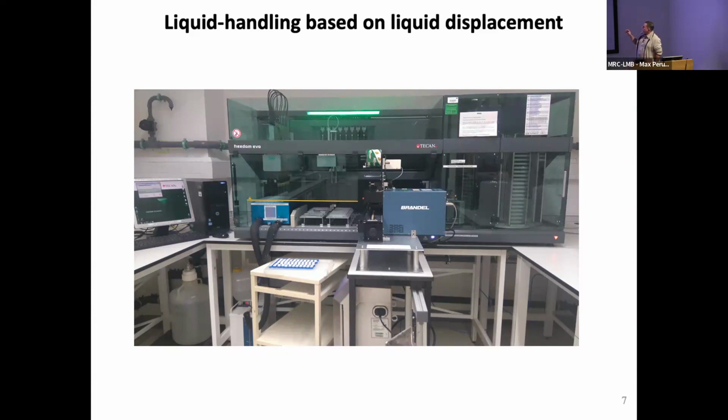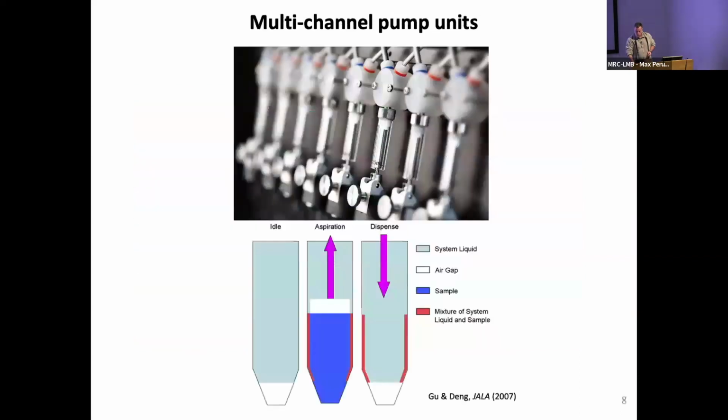So this is actually not only a liquid handler. The liquid handler part is the EVO, but it's a fully automated system with other integrated pieces, like a carousel on the right here, a sealer that is triggered automatically during the process. And we had an inkjet printer as well to label the plates on the fly. We don't have that anymore, but it was part of it before.